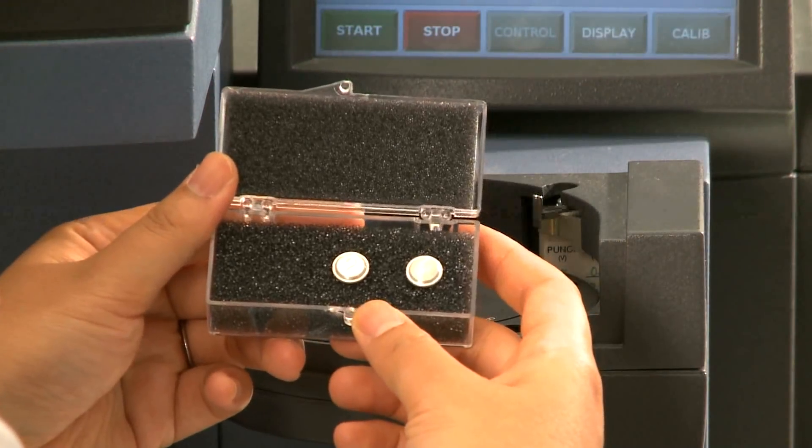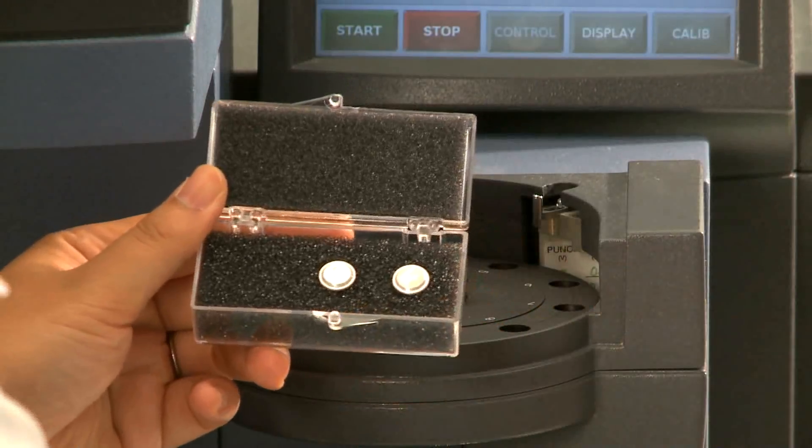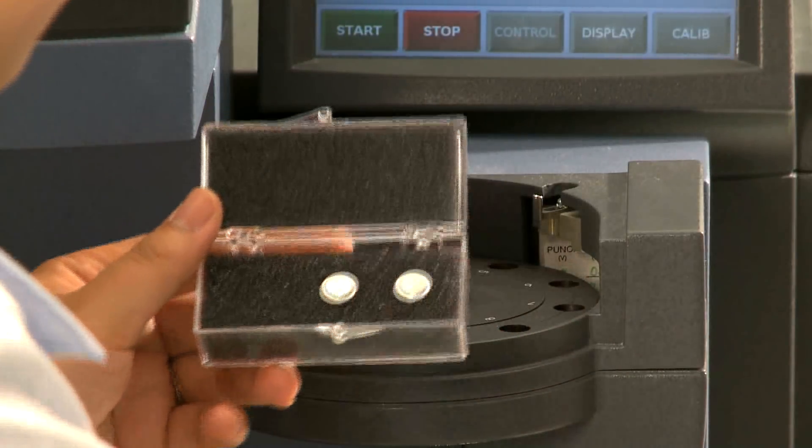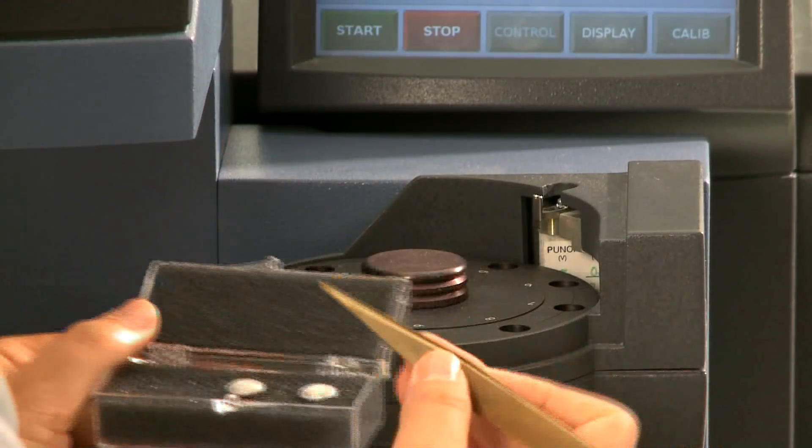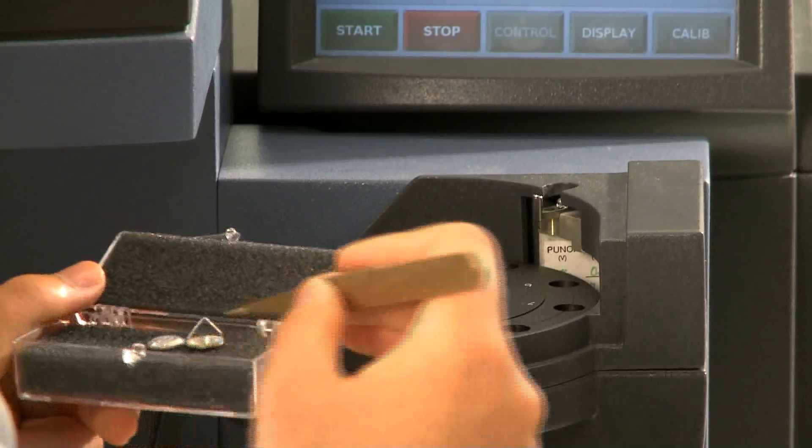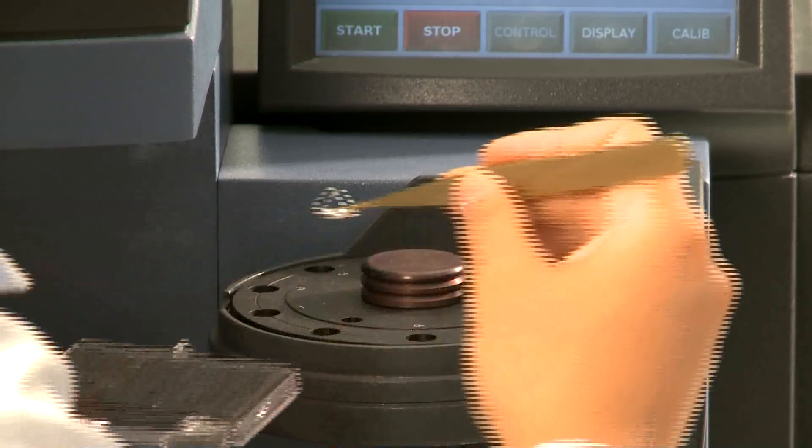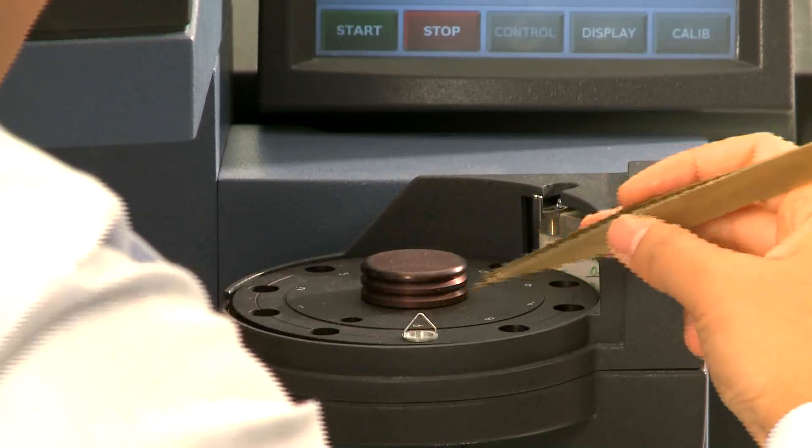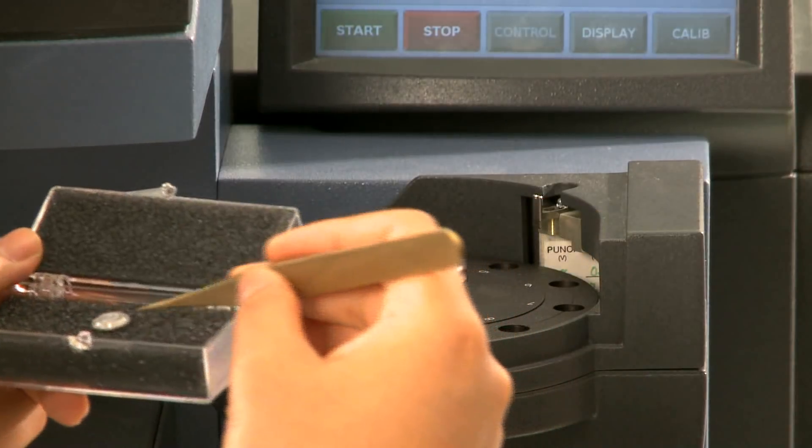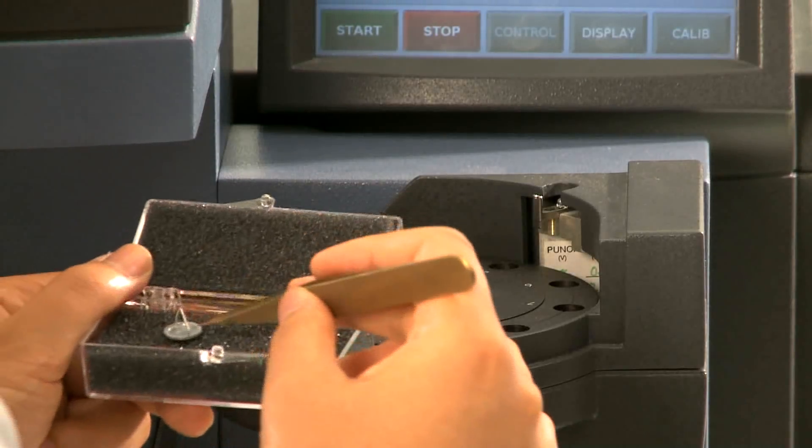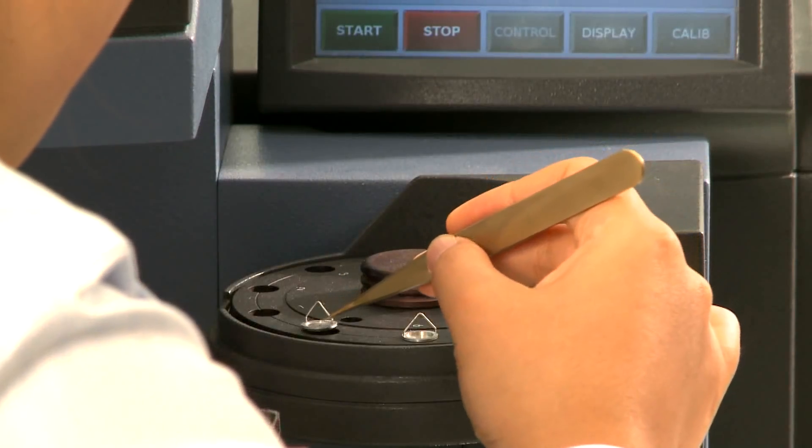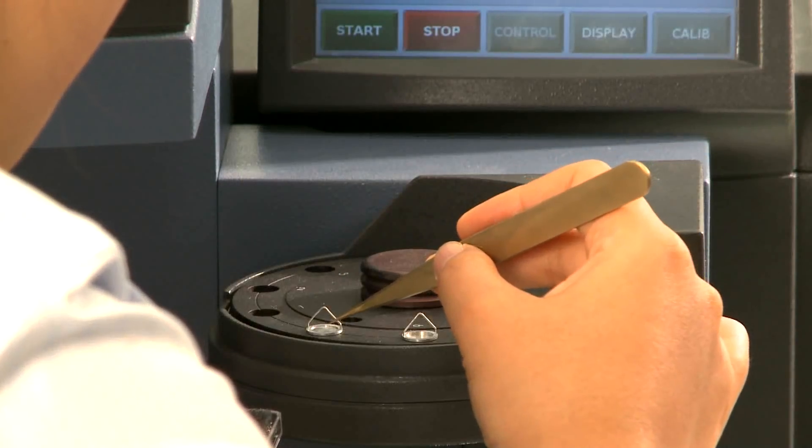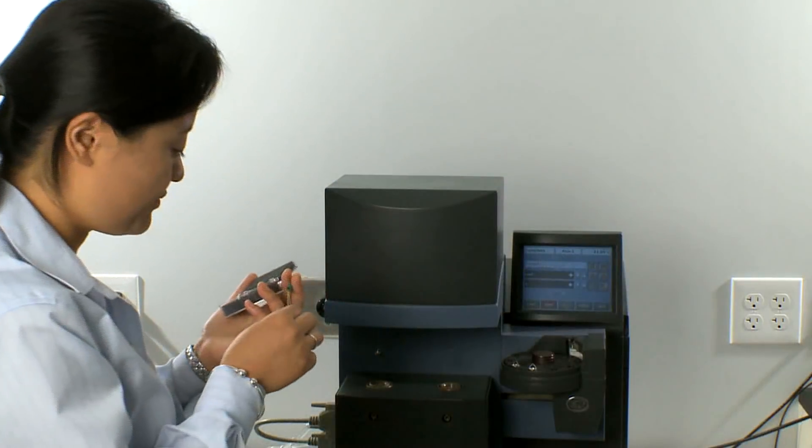We're going to use pen 1 first. Put pen 1 on position number 9 and put pen 2 on position number 10 of the autosampler.